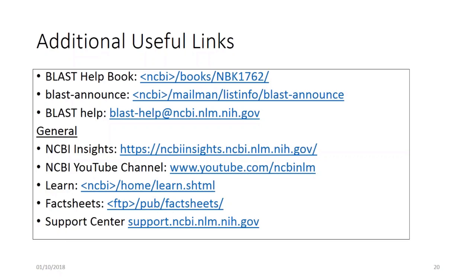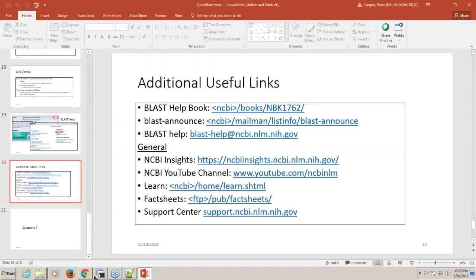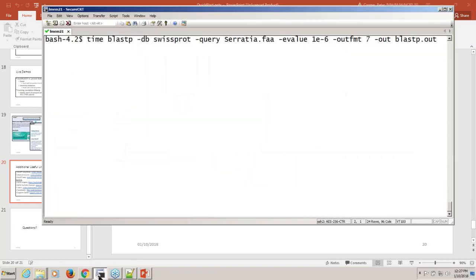So let's escape from here real quick and see if that finished. No, it's still running. We can check back in a few minutes. Nope, just finished. So it took about 2 minutes to run that.